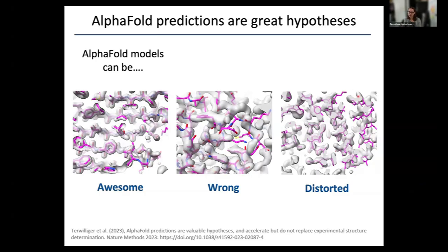It's not quite right, but it's also not completely wrong. And for all three cases here, the pLDDT values were actually high. So still, even with these very useful confidence measures, they don't necessarily reflect what is in the actual structure that is compared with experimental data.